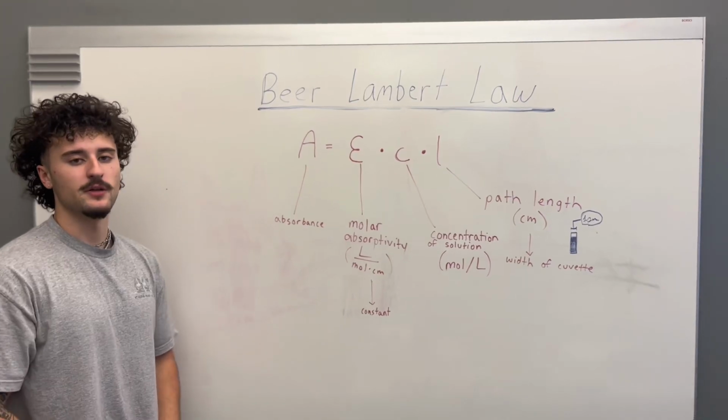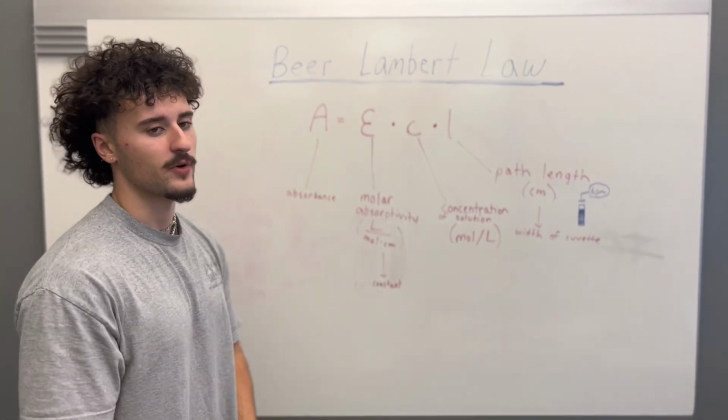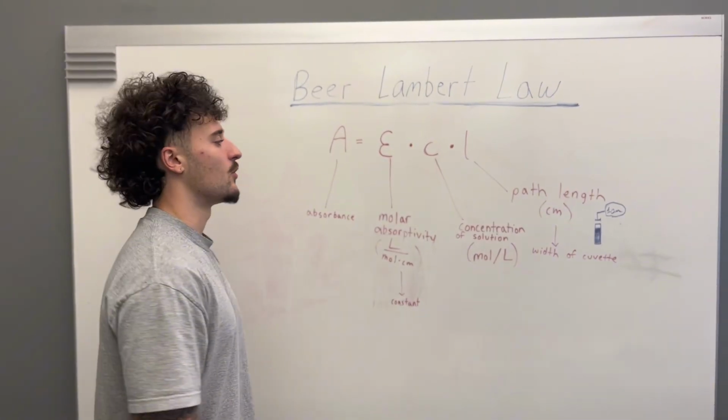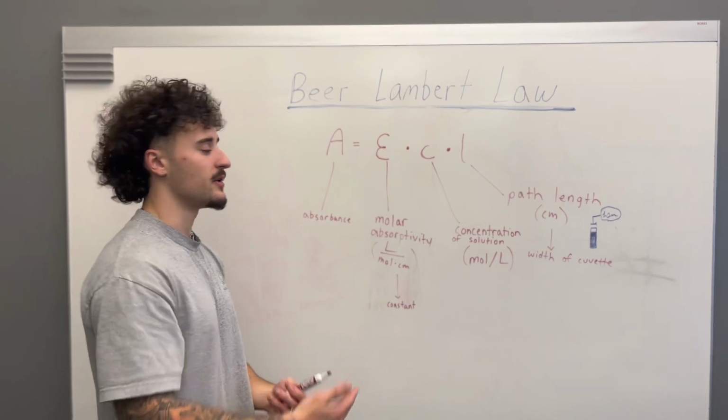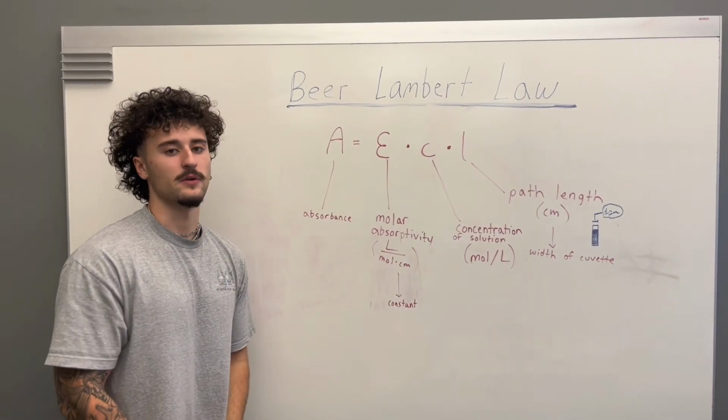Another thing to note that's important is the absorbance and the concentration are directly correlated. If the absorbance goes up, the concentration is going to go up. Or if you were to flip that around, if you have your concentration going up, that means the absorbance is also going to go up.